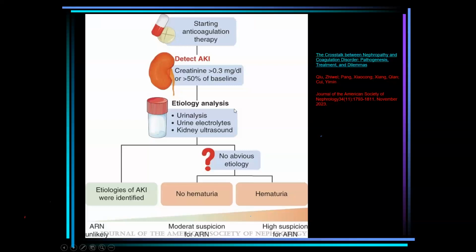So this simple algorithm from a recent article, I brought it in order to complement the issue of red blood cell casts in the renal tubule.